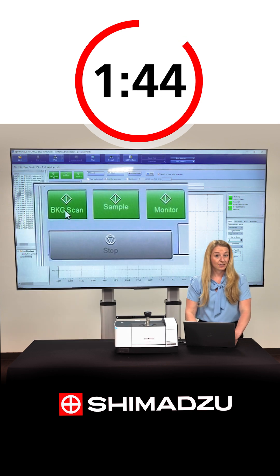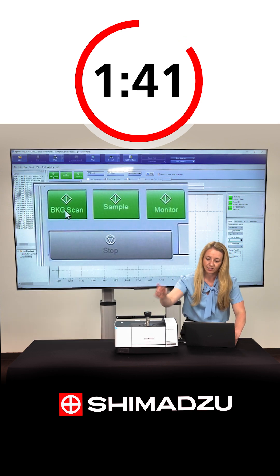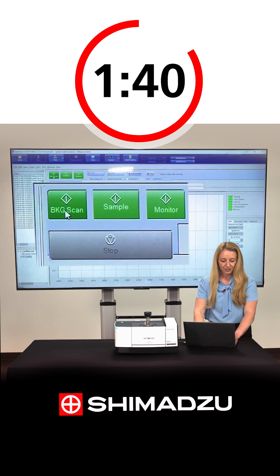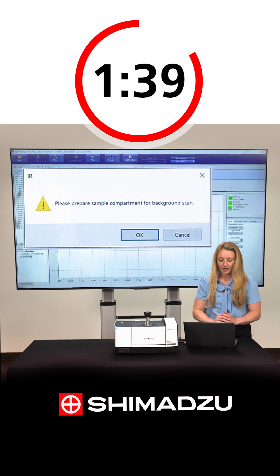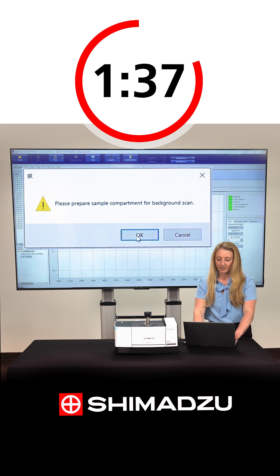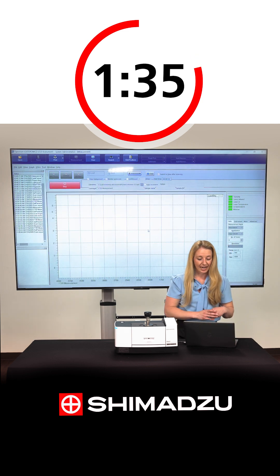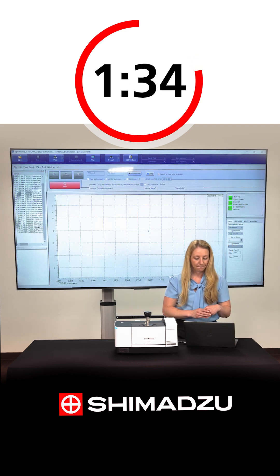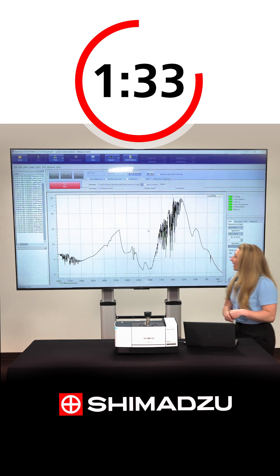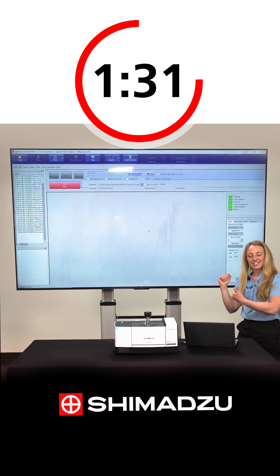So I can select background scan with the ATR in this position, and it warns me to make sure that the sample compartment is ready. Select OK, and here's a spectrum of our diamond ATR.